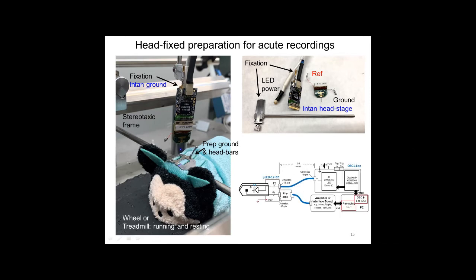Basically, this is the electronic circuit connection. As I said, you have the electronic part for recording the signals, and then you have the other connector going through the controller for powering the LEDs. And here we use the current controller developed by NeuroLight Technologies for the purpose of controlling the probe.